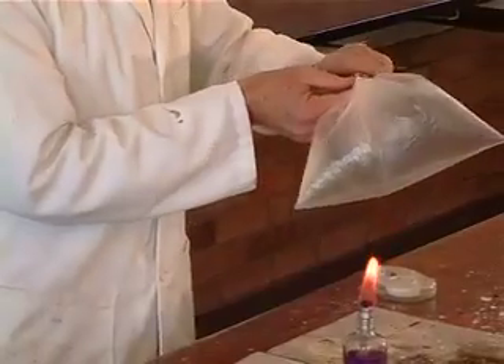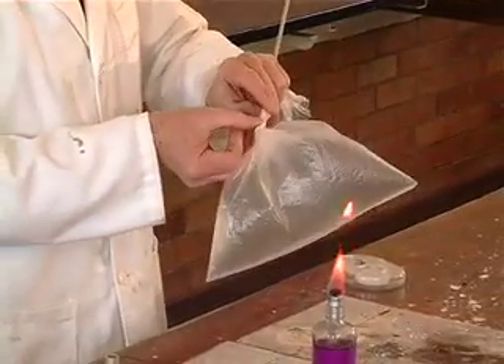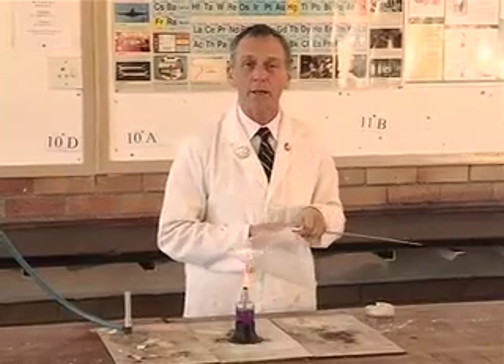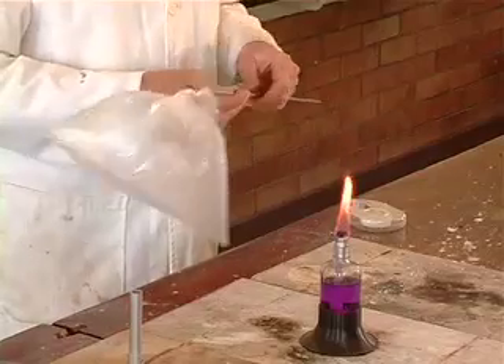We're going to tie this onto the stick so I'm not too close to it, because the energy released by the oxidation of the alkane gas is going to be quite hot — the energy around the plastic bag. The products produced here are going to be carbon dioxide and water vapour, the same as what comes out of exhaust pipes.